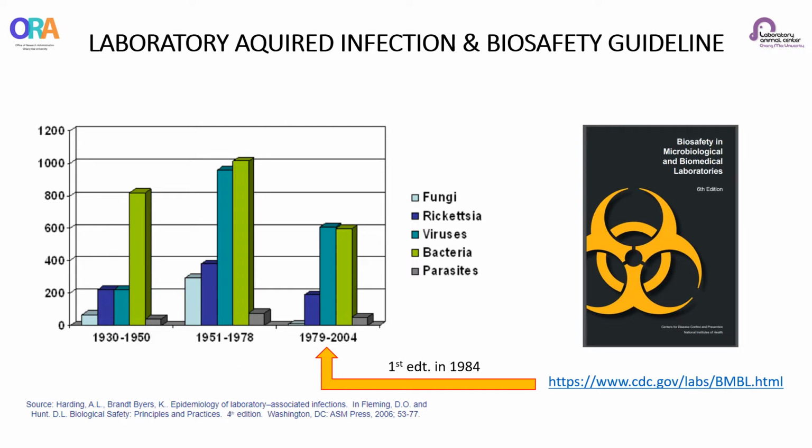Why must we try to understand biosafety? The reason is LAI, laboratory acquired infection. Infections have long been associated with working in the laboratory.